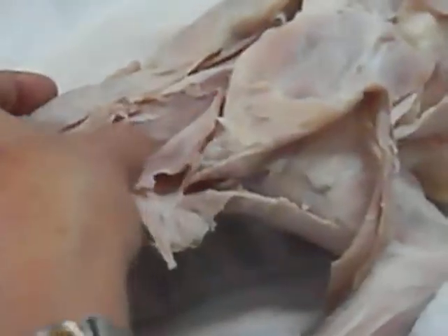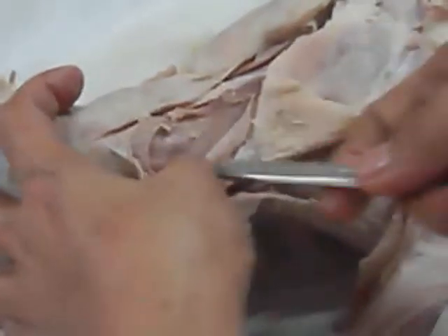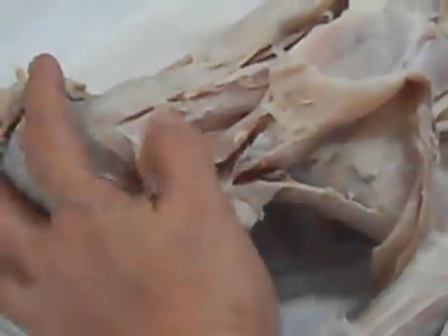It's biventer. Biventer. Biventer complexus. Subscapularis.